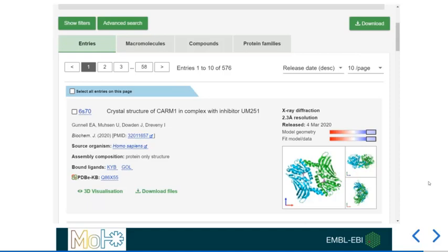I don't think the instances of Molstar on the PDBe website will allow you to upload and view that, but certainly on the molstar.org bleeding edge instance, that might be a feature that you could play with. If you have specific data sets that you are playing with, you can always get in touch with the Molstar team or the PDBe team. Of course, and with specific details about what you're using to find out more about that as well.